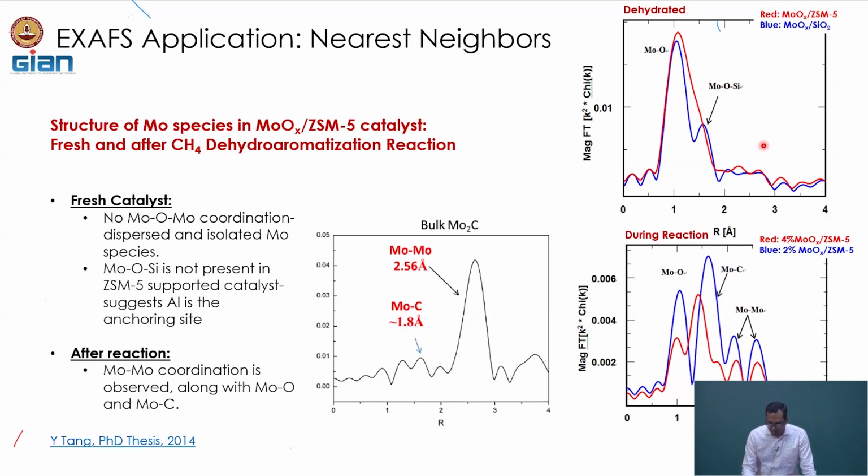So if we are not seeing any molybdenum oxygen molybdenum, that means there is no polymerization. These are isolated moly sites.